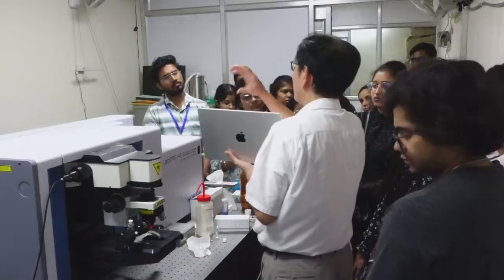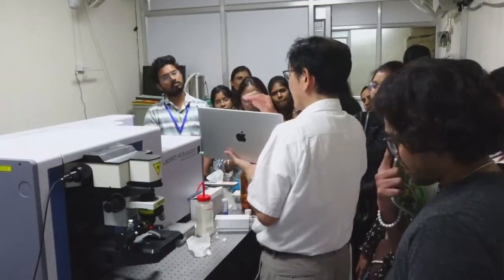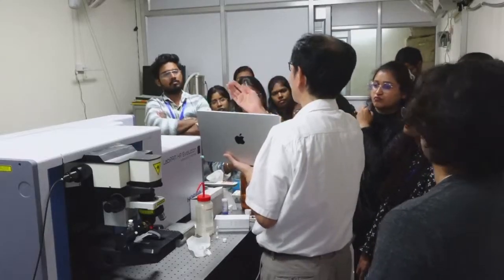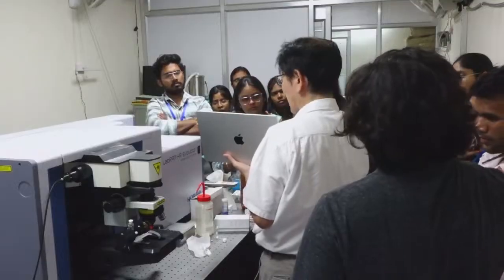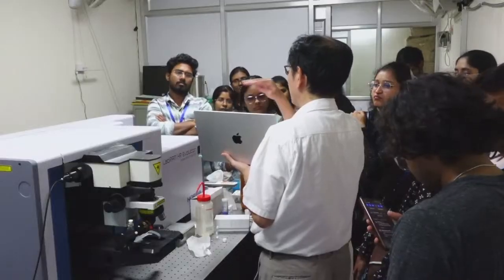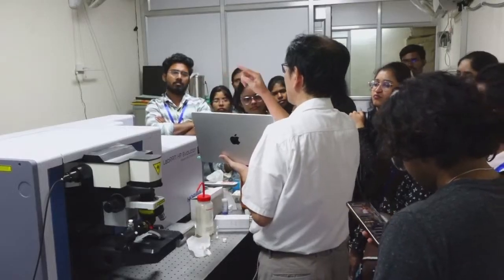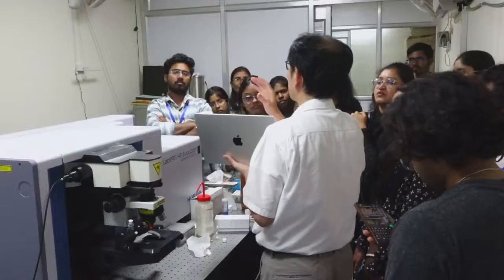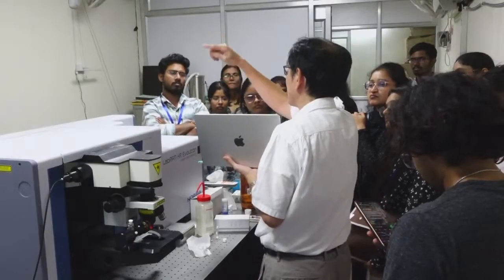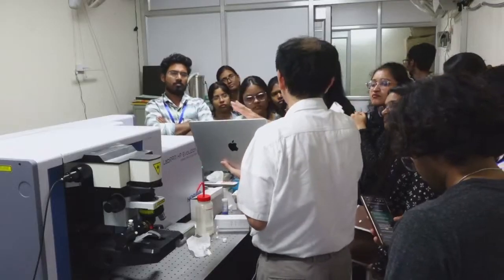At that time, error occurs. So in principle, it should be continuous. So if the measurement count is small, that kind of analog to digital conversion noise becomes prominent. So to avoid such a situation, we should accumulate signal count, and the maximum is 2 to the 16th power, around 65,000. If we reach a signal intensity close to 65,000, then that kind of AD conversion noise becomes less prominent.